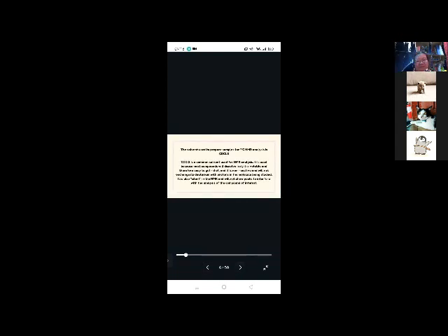The solvent used to prepare samples for carbon-13 NMR analysis is CDCl3. It is a common solvent used for NMR analysis because most compounds will dissolve in it. It is volatile, with a low boiling point, and therefore easy to get rid of. It is also non-reactive and will not exchange its deuterium with protons in the molecule being studied. It is also silent in the NMR and will not show peaks that interfere with the analysis of the compound of interest.